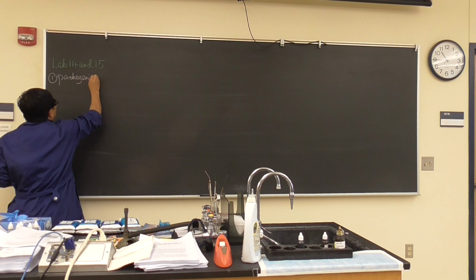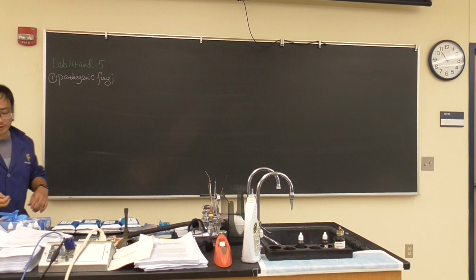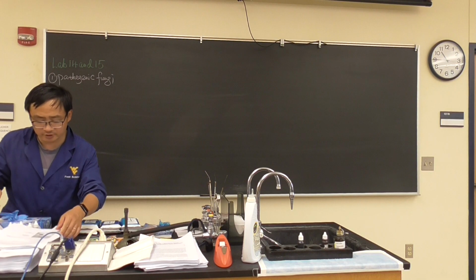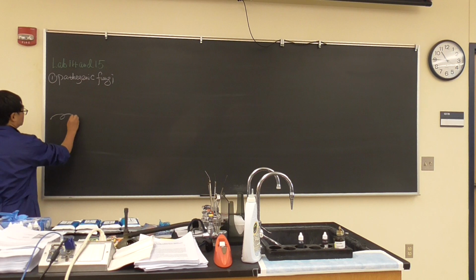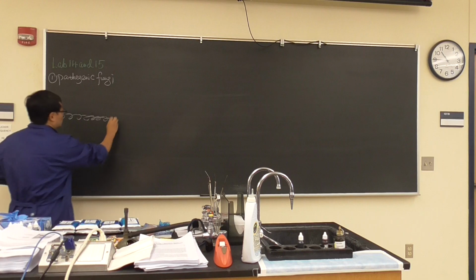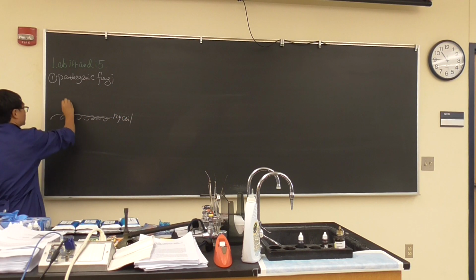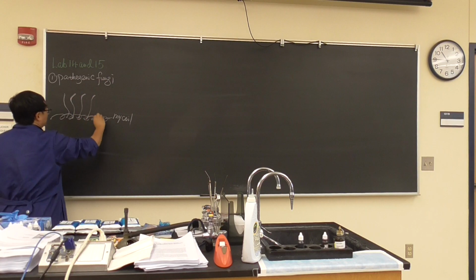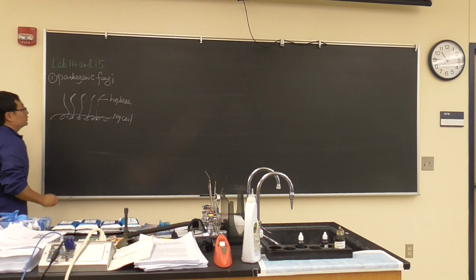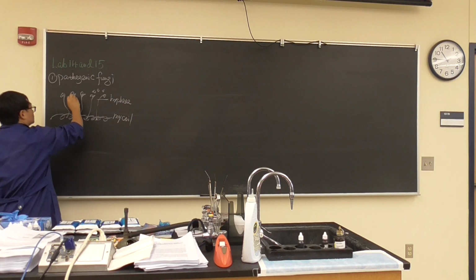If you look at the fact sheets, the fungi basically is very messy at the bottom. This is called mycelium. And then they will generate some of these called hyphae. And then they will generate those things called spores.